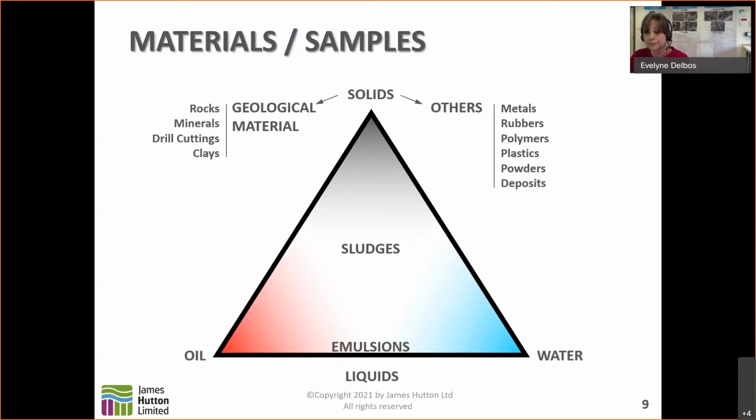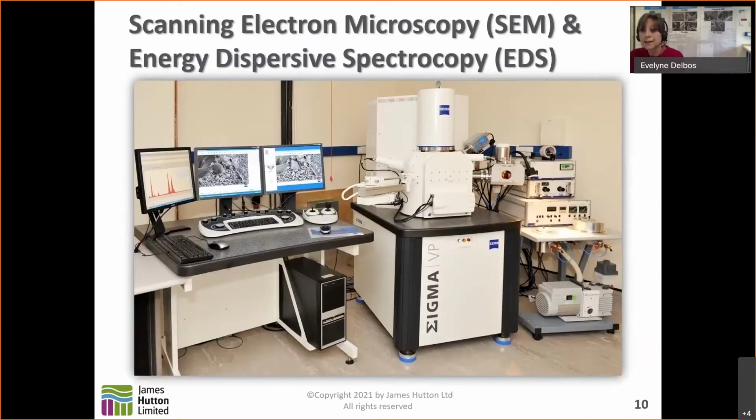Next slide, please. So SEM and EDS, electron microscopy, this is the suite that we have, and we do have basically two instruments in one: the Scanning Electron Microscope, SEM, and the energy dispersive spectrometers, the EDS spectrometers. Next slide, please.